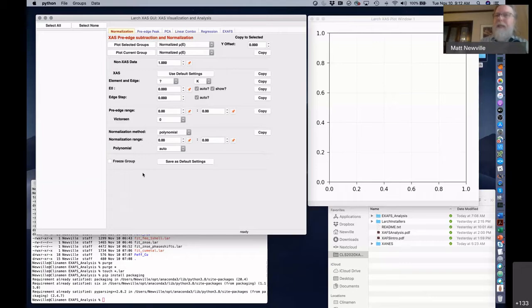So it's not simply the coordination number, because if the disorder is big enough, then where you think you have one atom with a single sigma squared, you might actually have distances that are a little bit apart, but the spread between them has a lot of overlap.